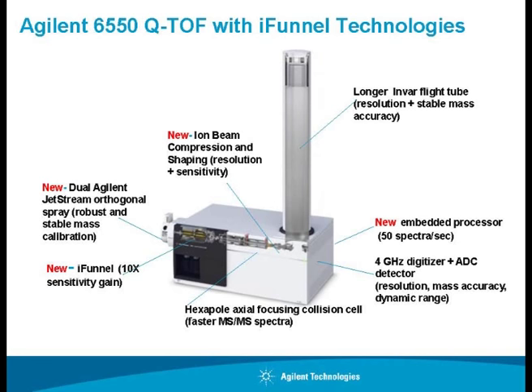Okay, and it travels through the quadrupole, then you can trigger an MS-MS and then it can be measured in the time of flight. Why a quadrupole and why a time of flight, maybe we will discuss when we actually go into the lab. When you can see the various modes, you can realize why not only TOF? If TOF can do everything, as I told, accurate mass and resolution, then why do we need a quadrupole? Okay, so we will see that.